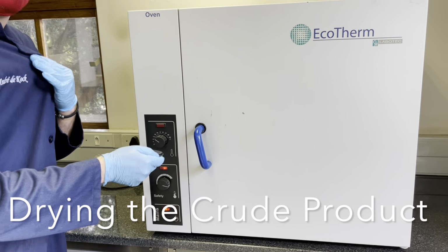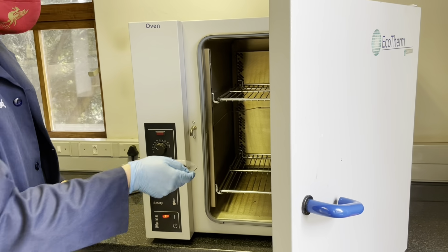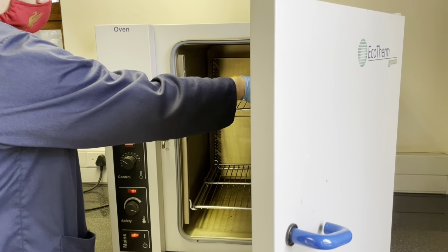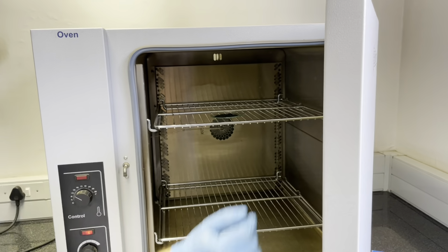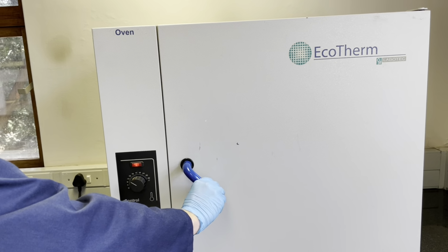Place your watch glass in the oven at 110 degrees and allow it to dry for between 10 and 20 minutes. You will need to judge this yourself depending on how wet your product was when you placed it in there.